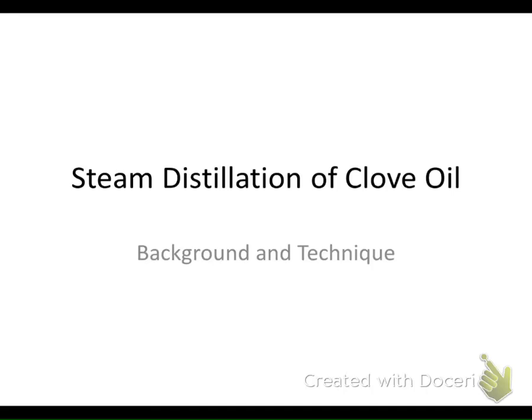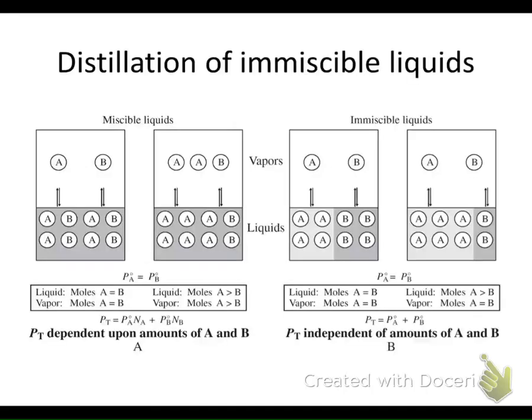Hi guys, Dr. K. What I thought we'd do is go over the background for next week's experiment, experiment 15A, the microscale procedure for the extraction of clove oil from cloves. Now, as you probably know, oils are not very soluble in water, and it lends to some interesting results when you do distillation. So let's go into the background of steam distillation of oils.